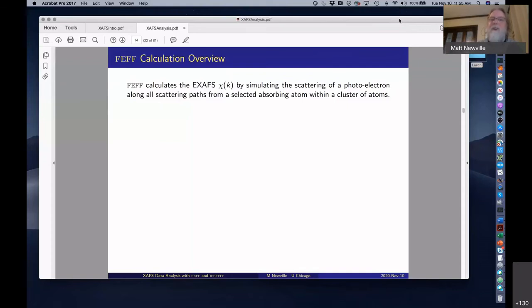If I have a functional form, so log gamma, I think, is what GNXAS uses, what are the parameters for that? There will be 2 or 3 parameters for that functional form, and they influence the intensity of each of those peaks and how they add up, and that will tell you G of R. So you're stepping through G of R. I think the wisdom is that once you go beyond the third cumulant, you're better off doing that. And then you're into highly disordered systems. You're into melts and liquids.